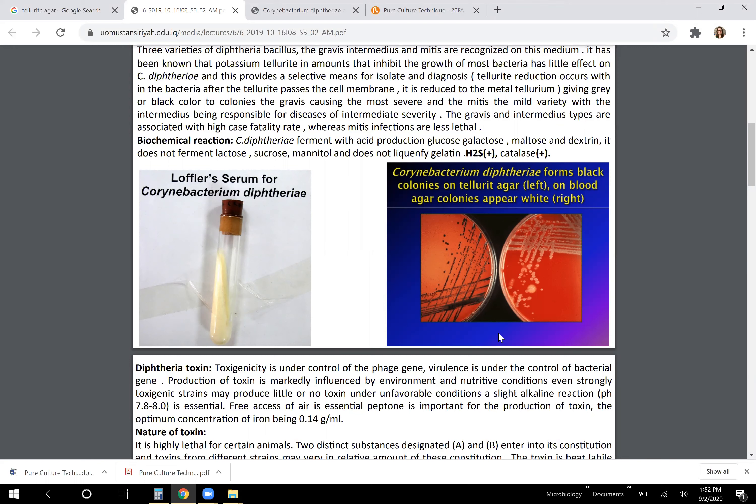So that's what they look like in their natural state. They would naturally be not pigmented. When you put it on the tellurite agar, they take up the tellurite. It goes through their metabolic process. It turns them black. So if you had colonies growing on tellurite agar that turned white, you would know they were not the Corynebacterium diphtheriae species.